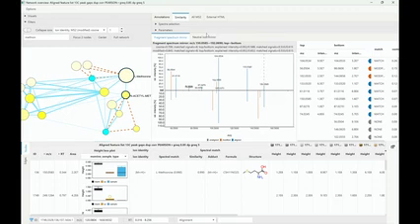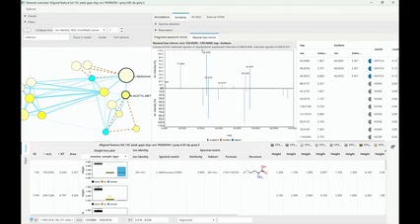If I want to see those, it's easier to flip the spectrum and flip over to the neutral loss spectrum. And then here those numbers, 46, is basically going to tell me I have a neutral loss of 46, so I can calculate the formula and then go annotate those spectra. So both methionine and N-acetylmethionine have the same neutral loss here.